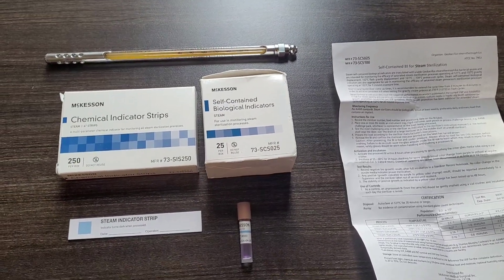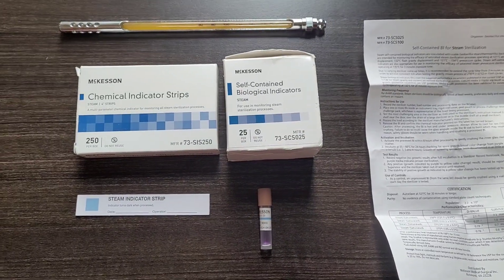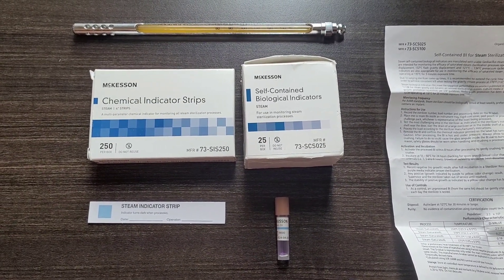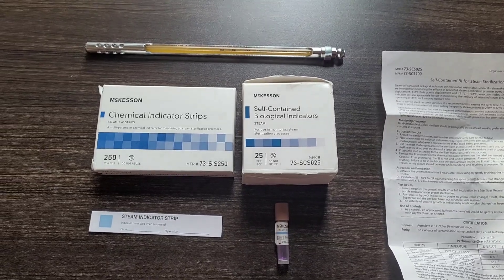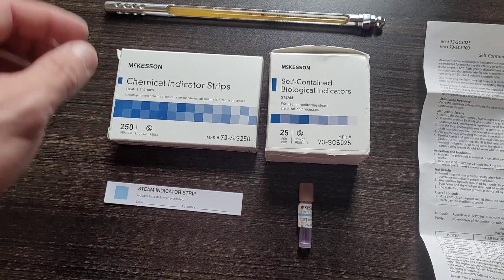Today we're going to do a little theory on autoclave function and verification. These items can be used to validate any steam sterilizing unit, whether it is a pressure cooker, autoclave, or atmospheric steam sterilizer. The items here are self-contained biological indicators, chem strips — you can read the labels.